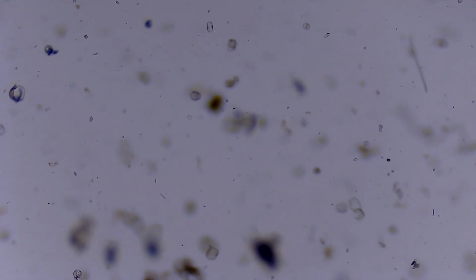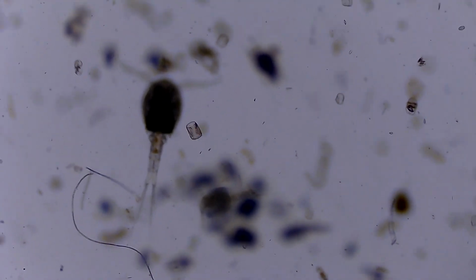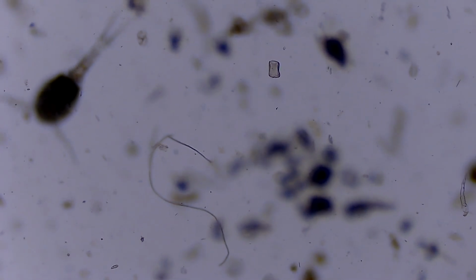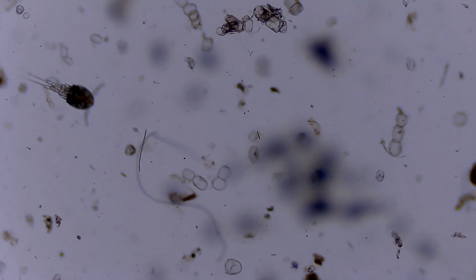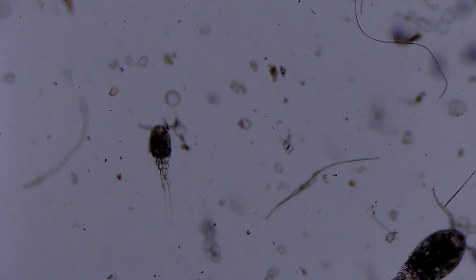All right guys, we went ahead and pulled just a single droplet of water from one of my fish tanks, and look what we see. Now, this looks like some kind of living organism. I'm not 100% sure. It could be a water flea, but it's probably some type of copepod. Maybe a water flea is a copepod. I'm not sure. But dude, guys, look, there's this worm thing in here too.